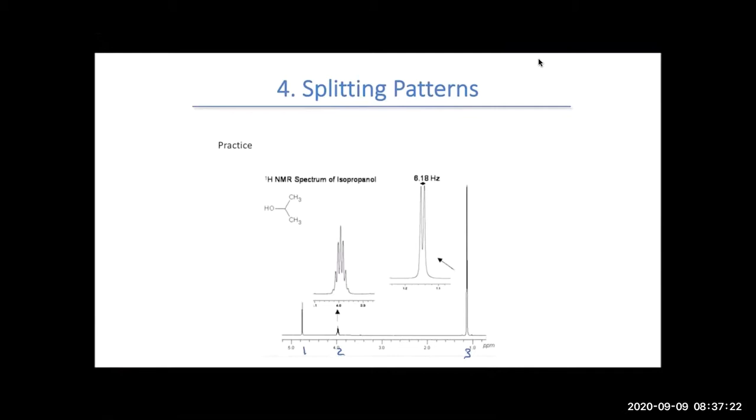Looking at these 3 peaks, we can see we have a few things. We have a singlet where I've designated as 1. At 2, we have 1, 2, 3, 4, 5, 6, 7 peaks. You can see the 2 on the very end become hard to see sometimes. And then the peak I've designated number 3, we can see it's a doublet. So looking at our compound, if we're to draw out the Lewis structure, we'd see there's a hydrogen in the middle there that's not shown in the line structure. And then I have my CH3 methyl groups.